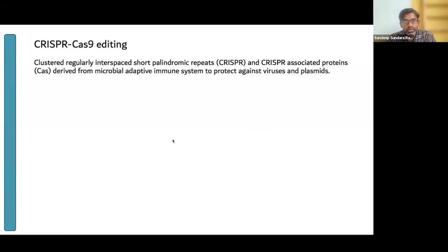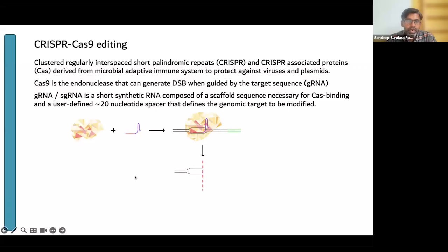I'm not going to delve too long into CRISPR-Cas9, but basically we know that CRISPR-Cas9 using the guide can generate a double-strand break, and this has two consequences in how the cell can choose to repair itself. One of them is homology directed repair, which produces an exact replica strand, correcting whatever has been damaged. The other one is non-homologous end joining repair, which can produce mismatches.